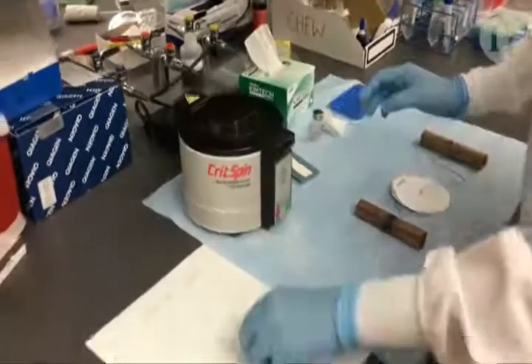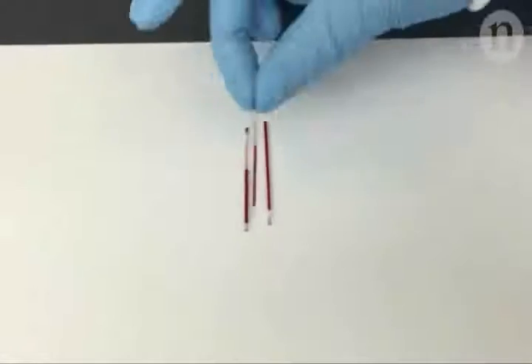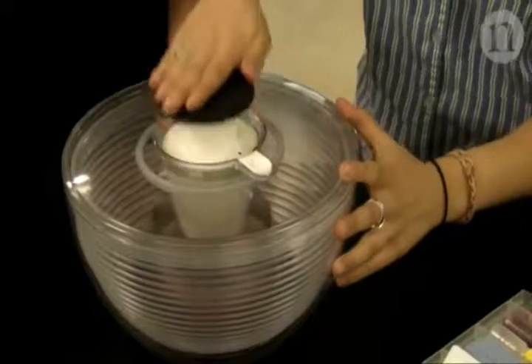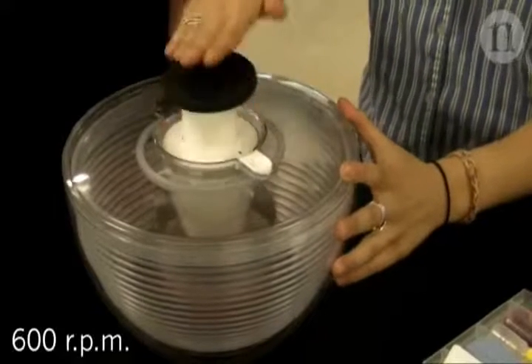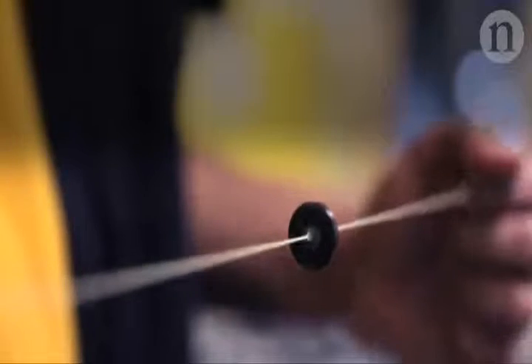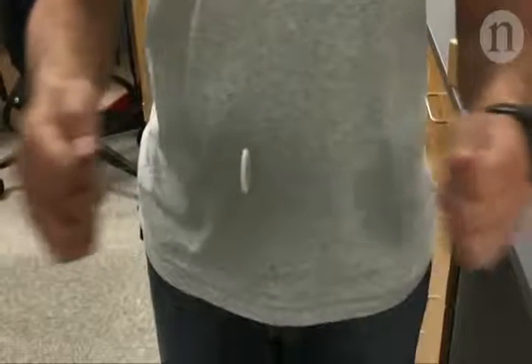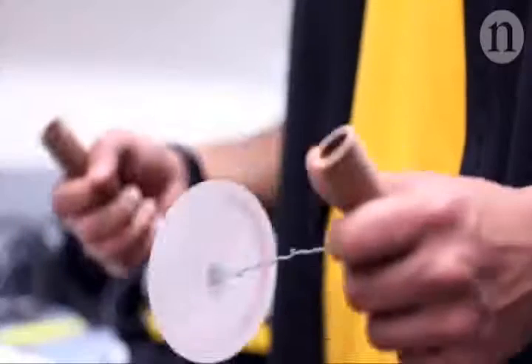In the quest for an affordable, electricity-free centrifuge, scientists have previously made use of a salad spinner. But this design is relatively slow. Now, scientists at Stanford have been inspired by a simple children's toy that can be made out of a button or a disc of paper.